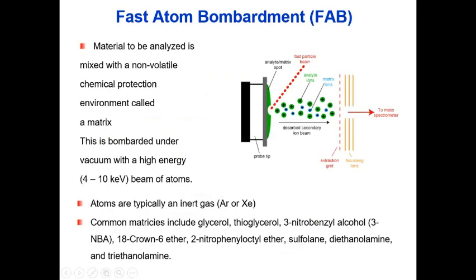And then next is fast atom bombardment ionization. This is another type of ionization technique.